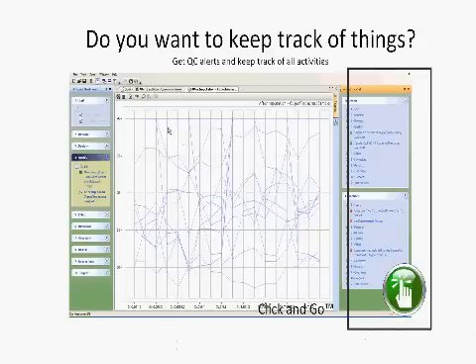And basically, within the advanced interface, you have the analysis workflow checklist, which basically goes from start all the way down to step 10, which is the report. You also have the interactive visual interface. So this is where you can highlight specific sections or specific detectors, maybe zoom in, etc.